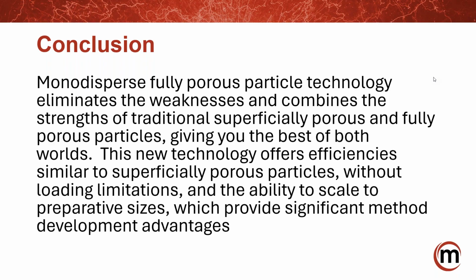And we think that's due to the significant coverage of the ligands because it's optimized with carbon C12 versus C18. You don't get any of the steric hindrance, which means you have to use less end capping. So what I would say is, as you increase temperature, you increase the mechanism kinetics, but I would also say it stands up very comparably to the industry standard materials.